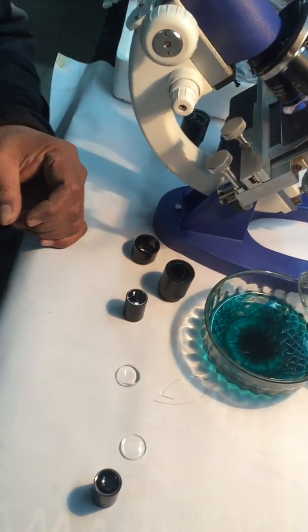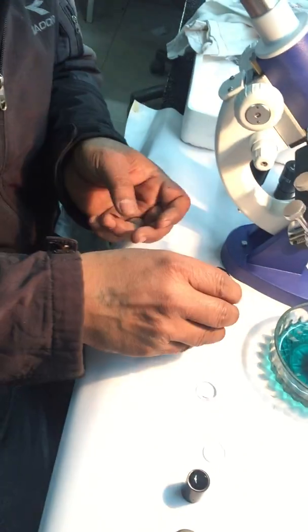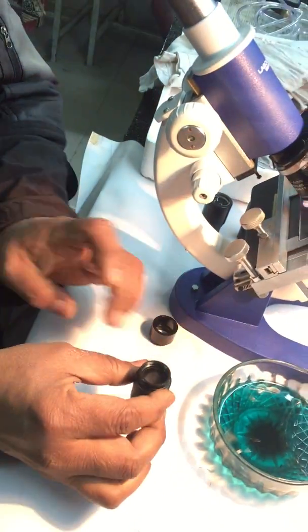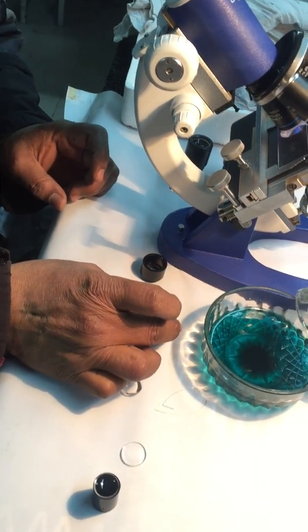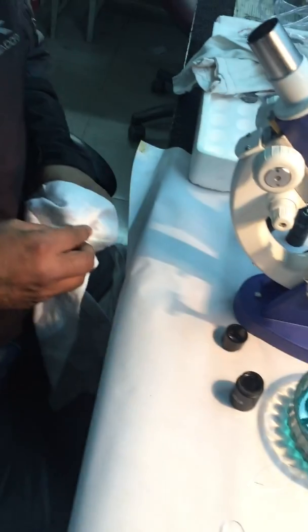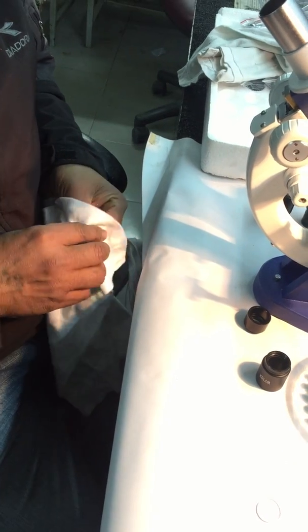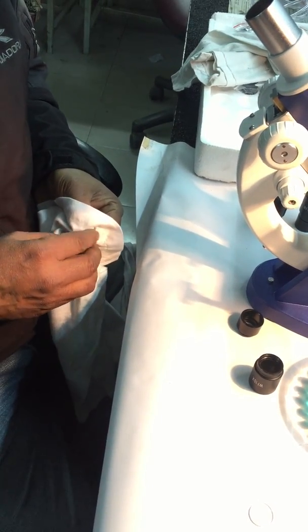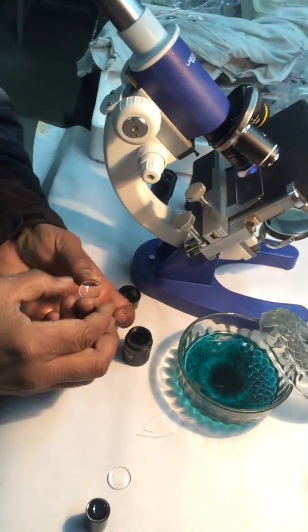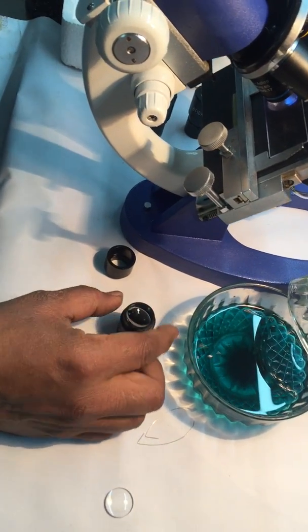Then the spacer, on top of the spacer. Upside down. Second component — field lens. Flat side up.